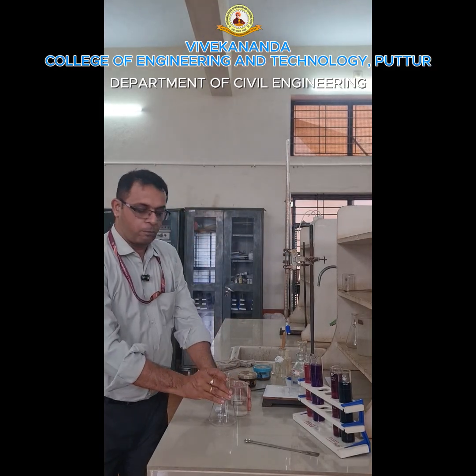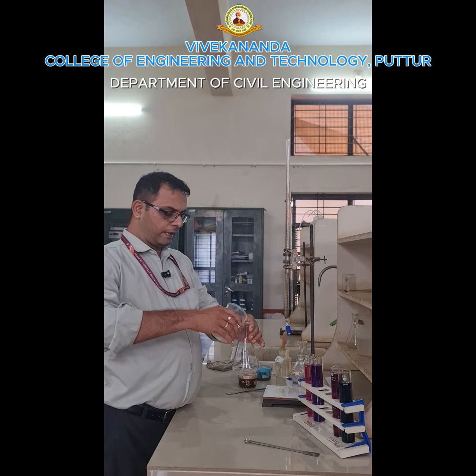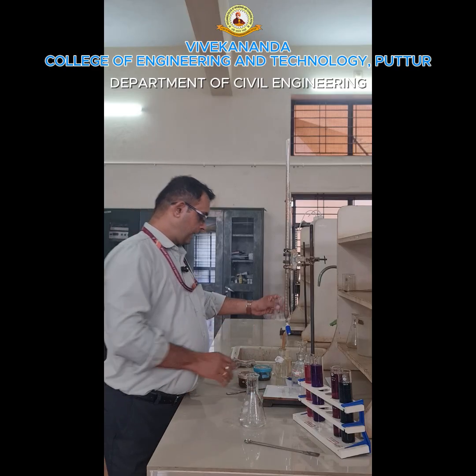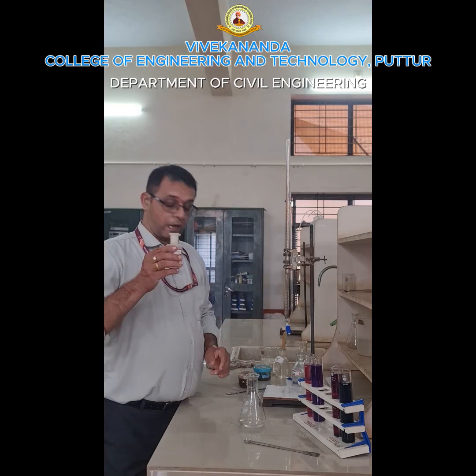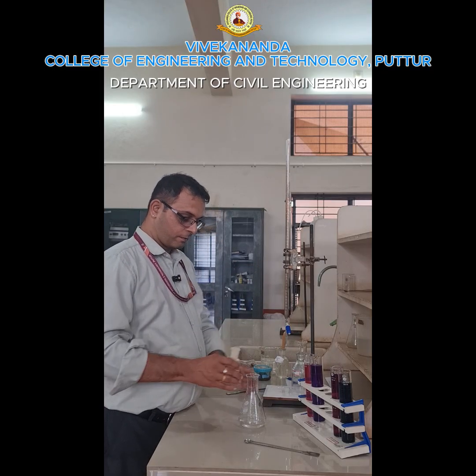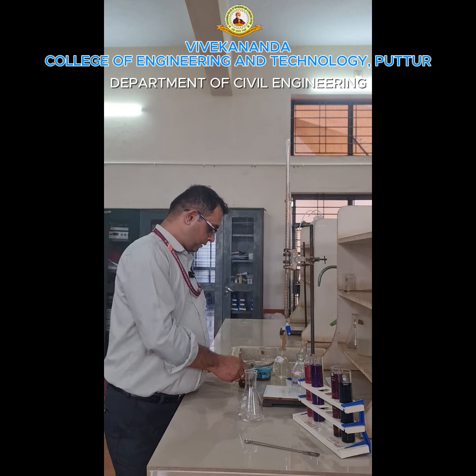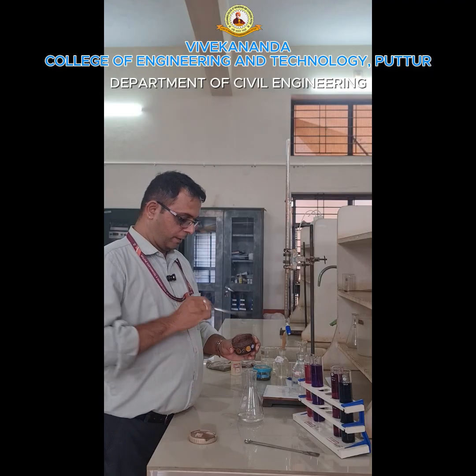Now I have once again boiled and cooled the sample. I will take 25 ml of sample. Then I will add ammonia buffer. I will stir it once again. I will take EBT.